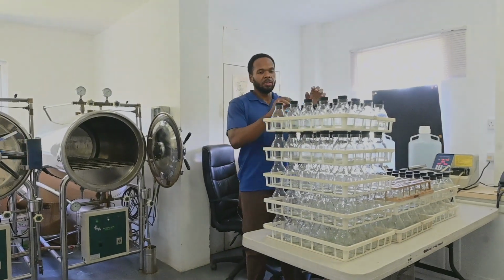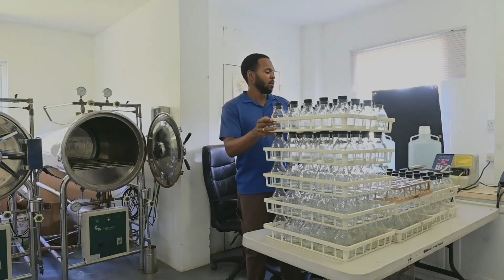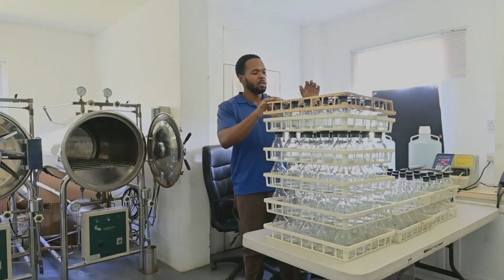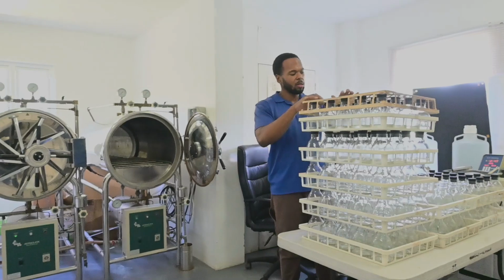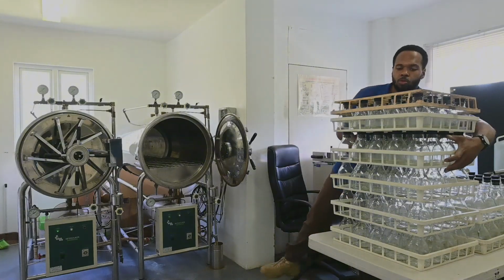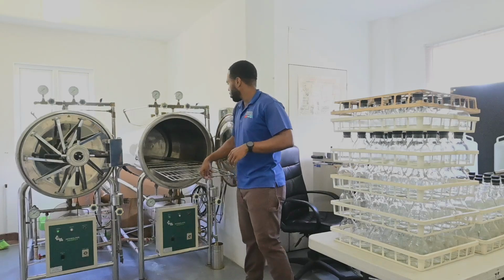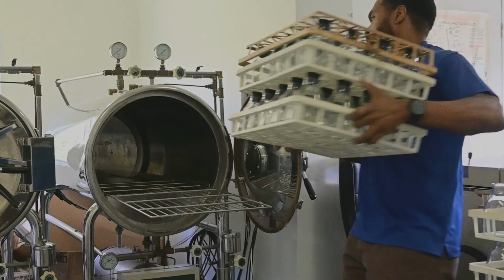After the covers are placed firmly on the bottle, we're going to stack two trays on top of each other. We're going to put an empty tray face down. The purpose of this is to prevent the occurrence of the covers popping out due to the high pressure in the autoclave. So we're going to now load the tray of the autoclave, and we place the trays two at a time.